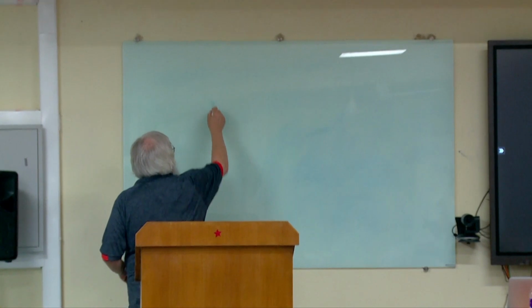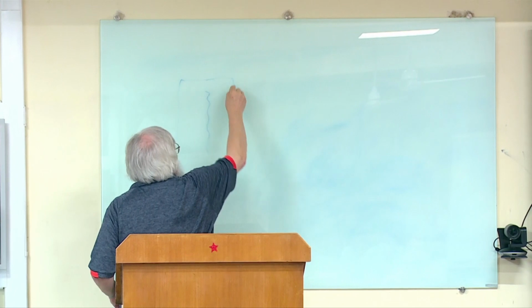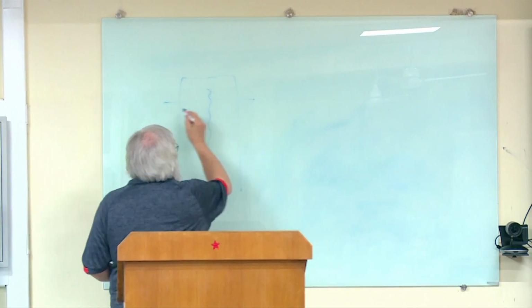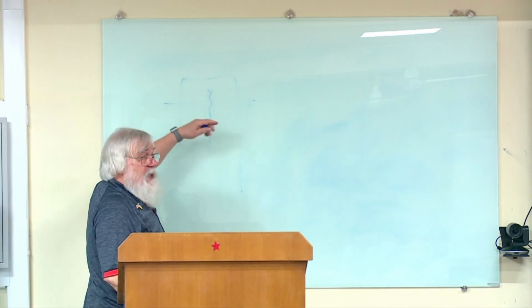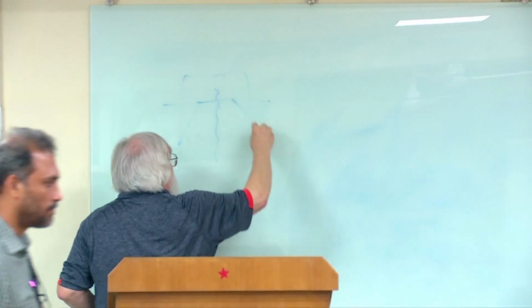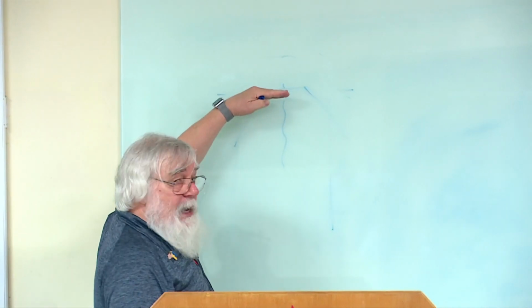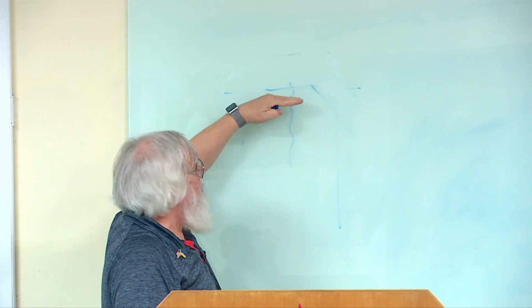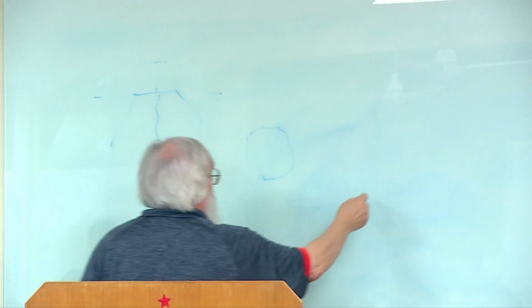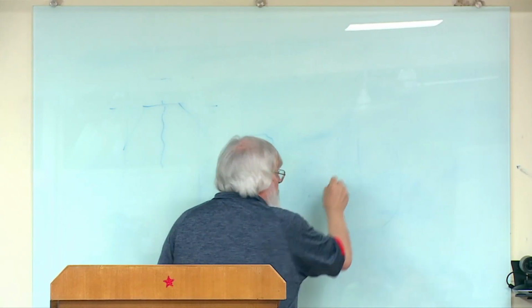All right, so he's got a thin polymer film. He's going to embed it in an epoxy capsule, okay? And then what we want to do is make a thin slice through it so we can look through it. So he's going to cut it so it looks something like that. And then he's going to take an ultramicrotome, a diamond knife, and make thin slices. Those thin slices are going to look like small sheets. He's going to pick them up on a copper grid and put it in the microscope.